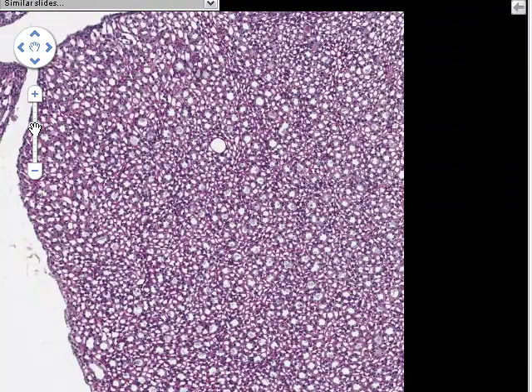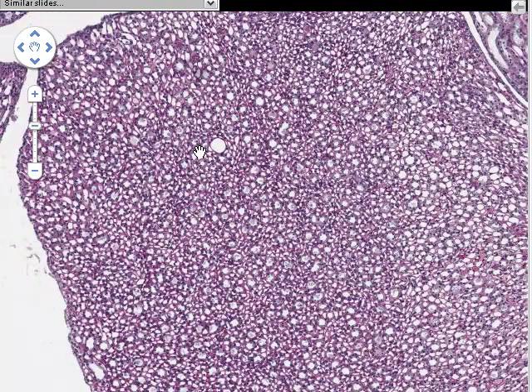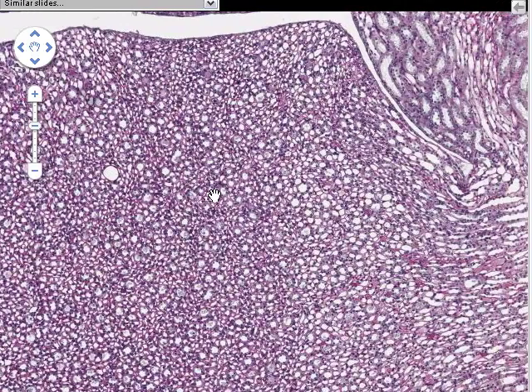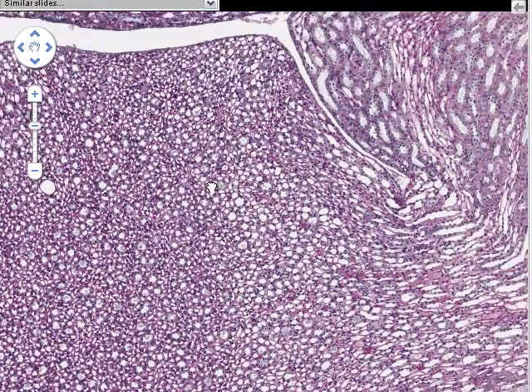So you could look around, you'll find epithelium which is definitively cuboidal, you'll find epithelium which is definitively squamous, and what you need to understand is that in fact many of these tubes, despite being lined with either cuboidal or squamous epithelium, are in fact one continuous tube, and it's just that the height of the epithelium varies over the length of the tube.